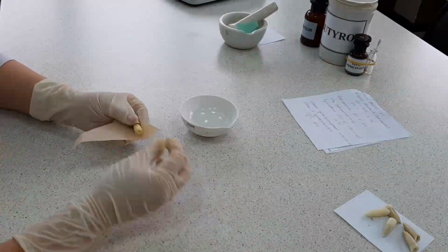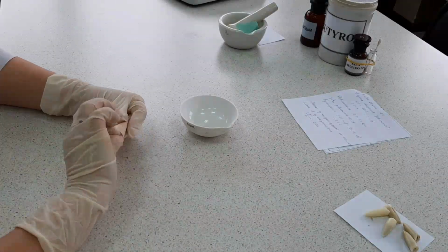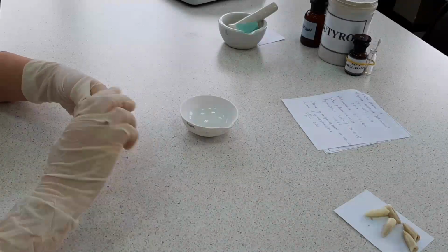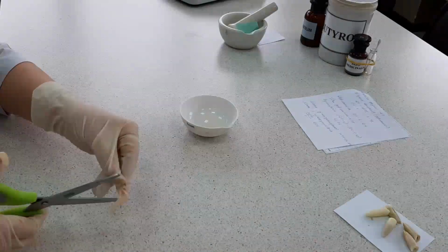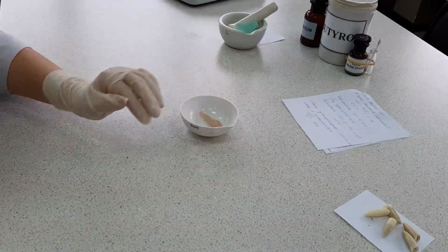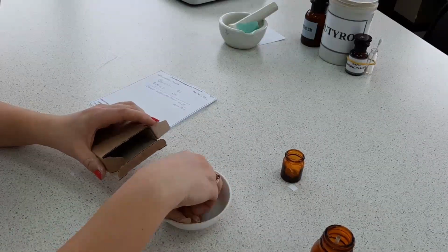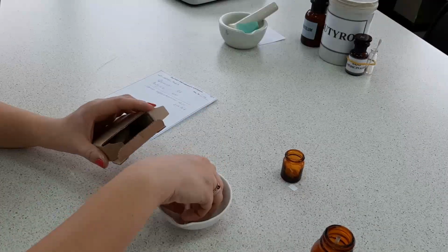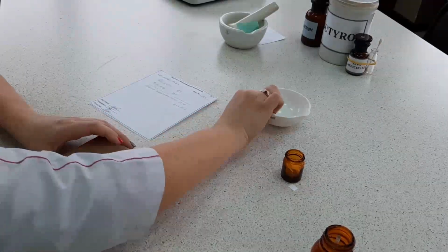Pack the obtained suppositories into a handkerchief of parchment paper, forming a cone. Cut the excess off. Place the wrapped suppositories into a cardboard box for dispensing and glue the prescription number. Give the medicine to the pharmacist analyst for quality control.